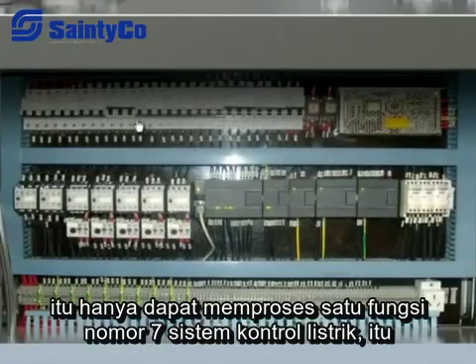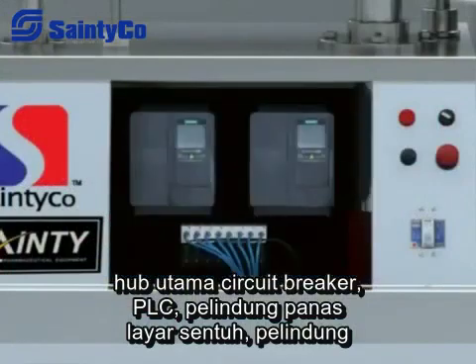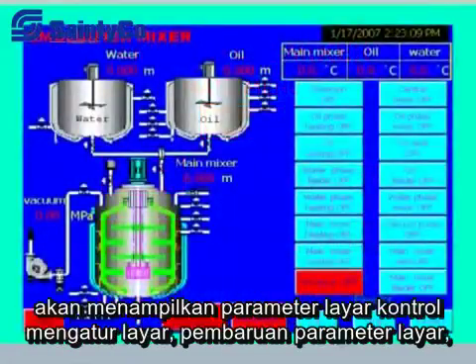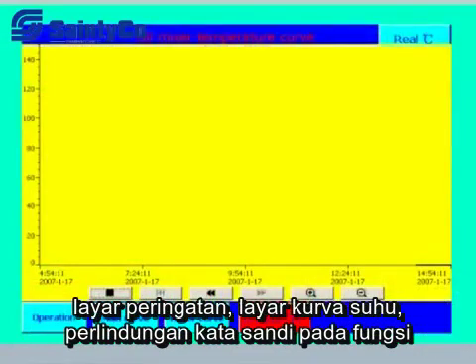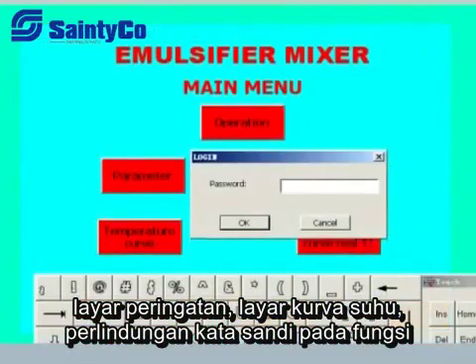The electric control system is made up of PLC, circuit breaker, heat protector, touch screen, frequency converter, temperature transducer, and electromagnetic valve. The touch screen displays the control screen, parameter set screen, parameter updating screen, temperature curve screen, warning screen, and password protection.